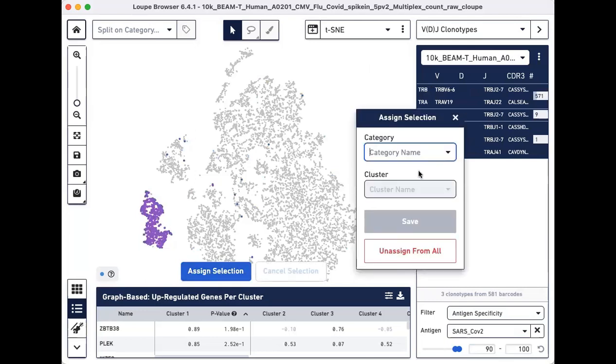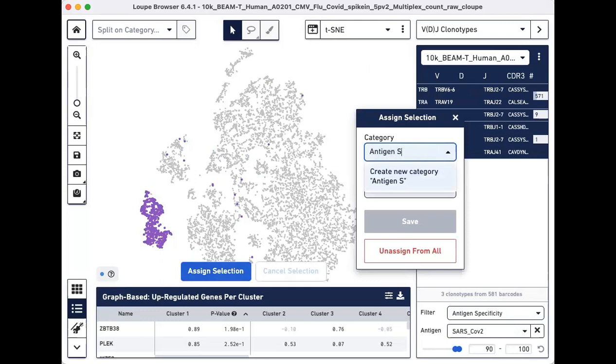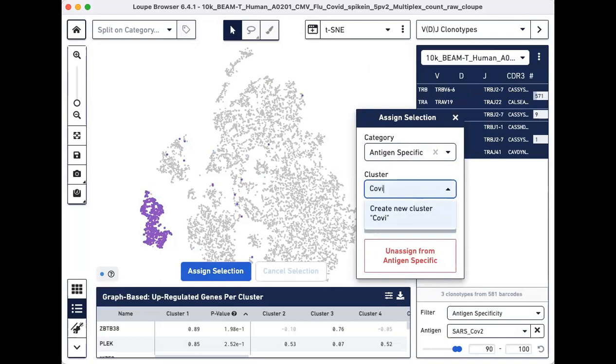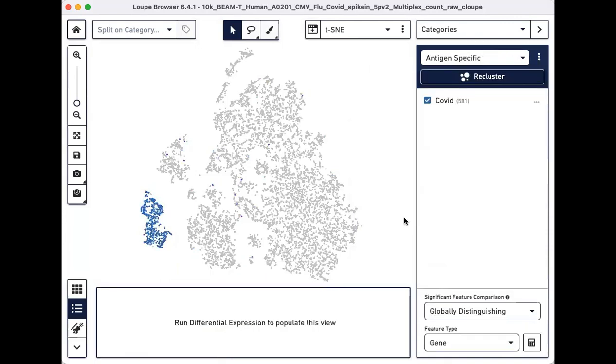For this tutorial, we will call the category Antigen specific and call this cluster of cells COVID and then hit save. The new cluster should show up on the right panel.